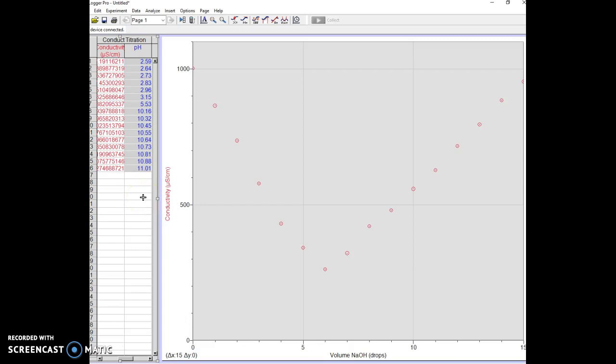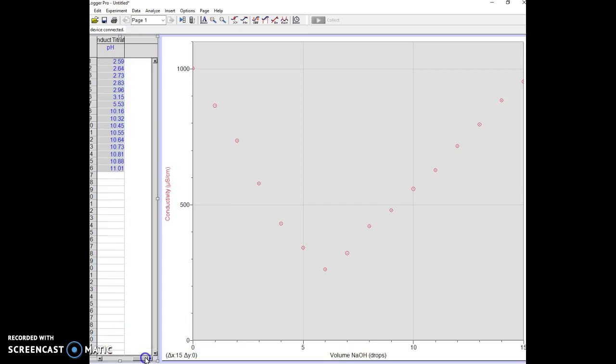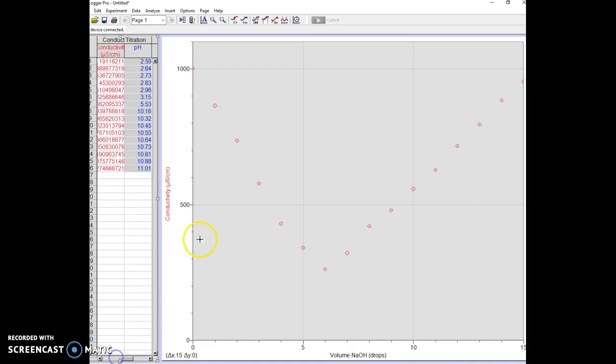Now, it is also possible, if for instance you have your data in your laboratory notebook instead, you can just type the pHs in here. If you don't have a perfect correspondence between the drops here, for instance, maybe you skipped a drop, or maybe you're doing it 2, 4, 6, 8, 10, you can always just come back and add a line in, skip one of these numbers here, and you'll still get a graph. However, as you see, we don't have a graph.